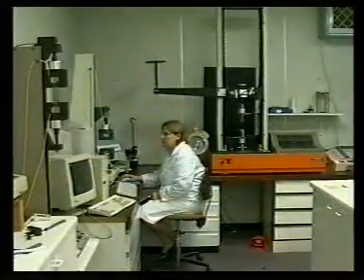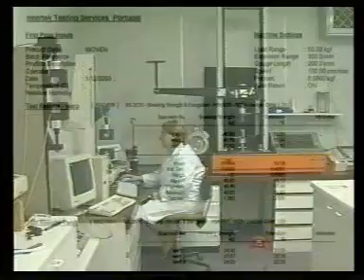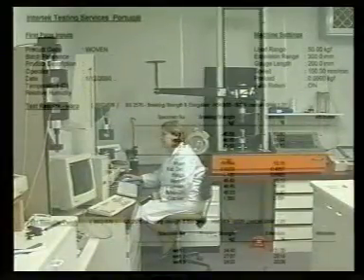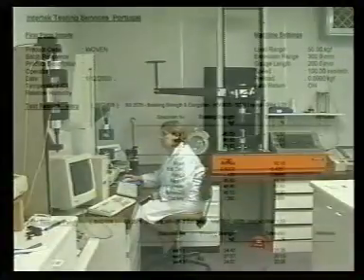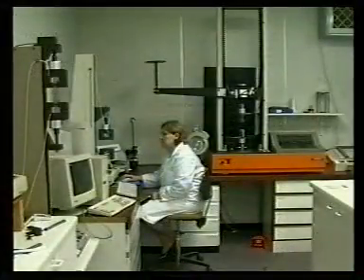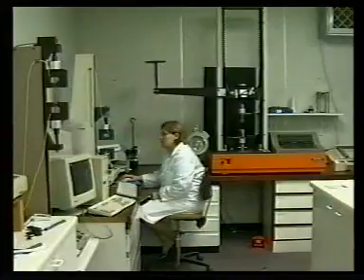The appropriate test program is selected from the computer menu and the specified details for the specimen are entered onto the screen. The computer will then set the machine up into the testing mode.